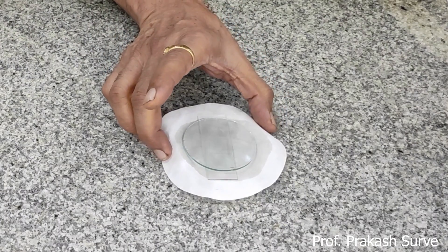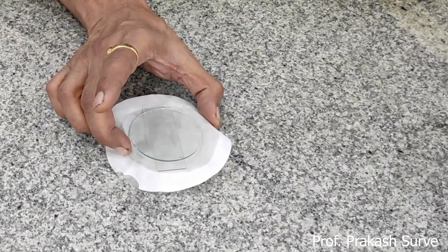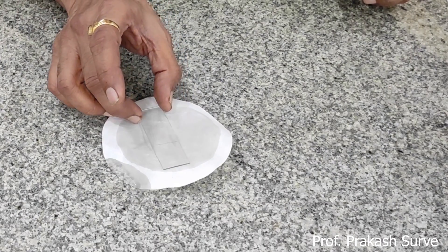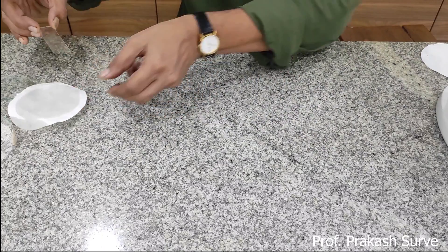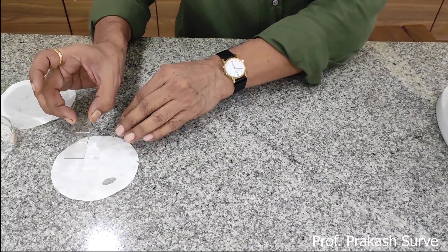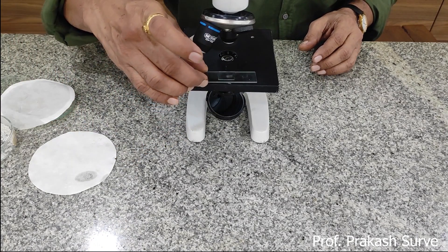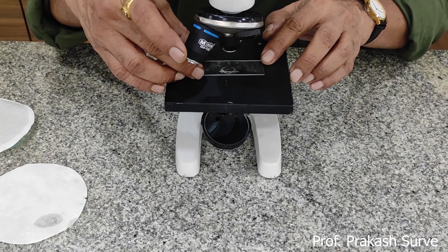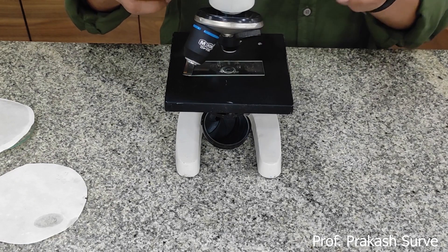After 30 to 40 minutes, the pollen grain will germinate. The pollen grain will absorb all the sugar solution; as a result, the internal volume increases, which exerts pressure on the intine. The intine comes out through the rupturing of the germ pore in the form of the pollen tube.